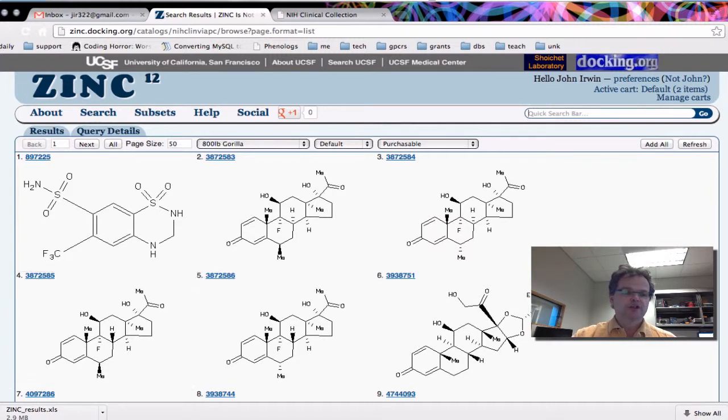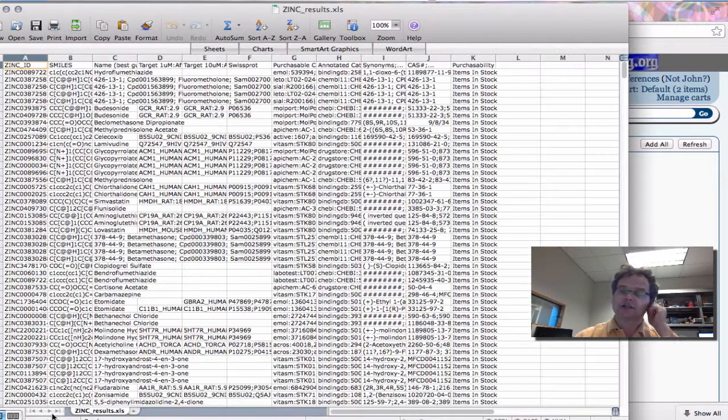Okay, so we're still up to 2.9 megabytes, and there, now it's finished. Okay, so now we're going to click on zinc results.xls, and it brings up Excel. Let's go through the results.